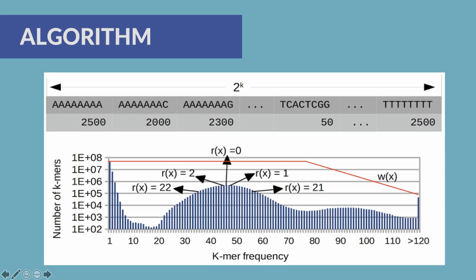First of all, k-mers among the reads are counted and organized lexicographically. Then, k-mers are ranked based on their counts and a hashing function that is defined as the distance of the ranking to the mode of the counts distribution is applied. Based on that function, we build a minimizers table from the reads to identify overlaps in linear time.